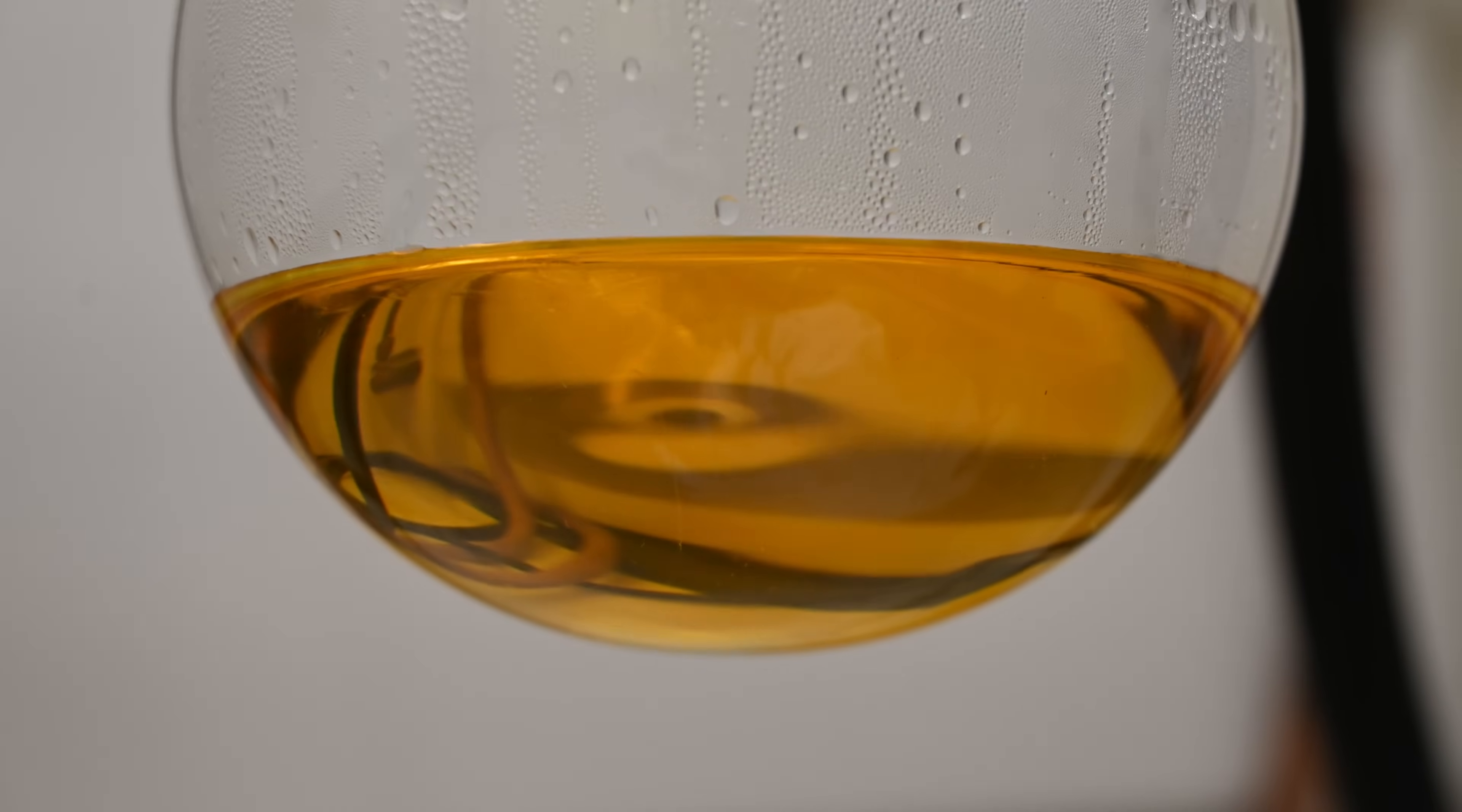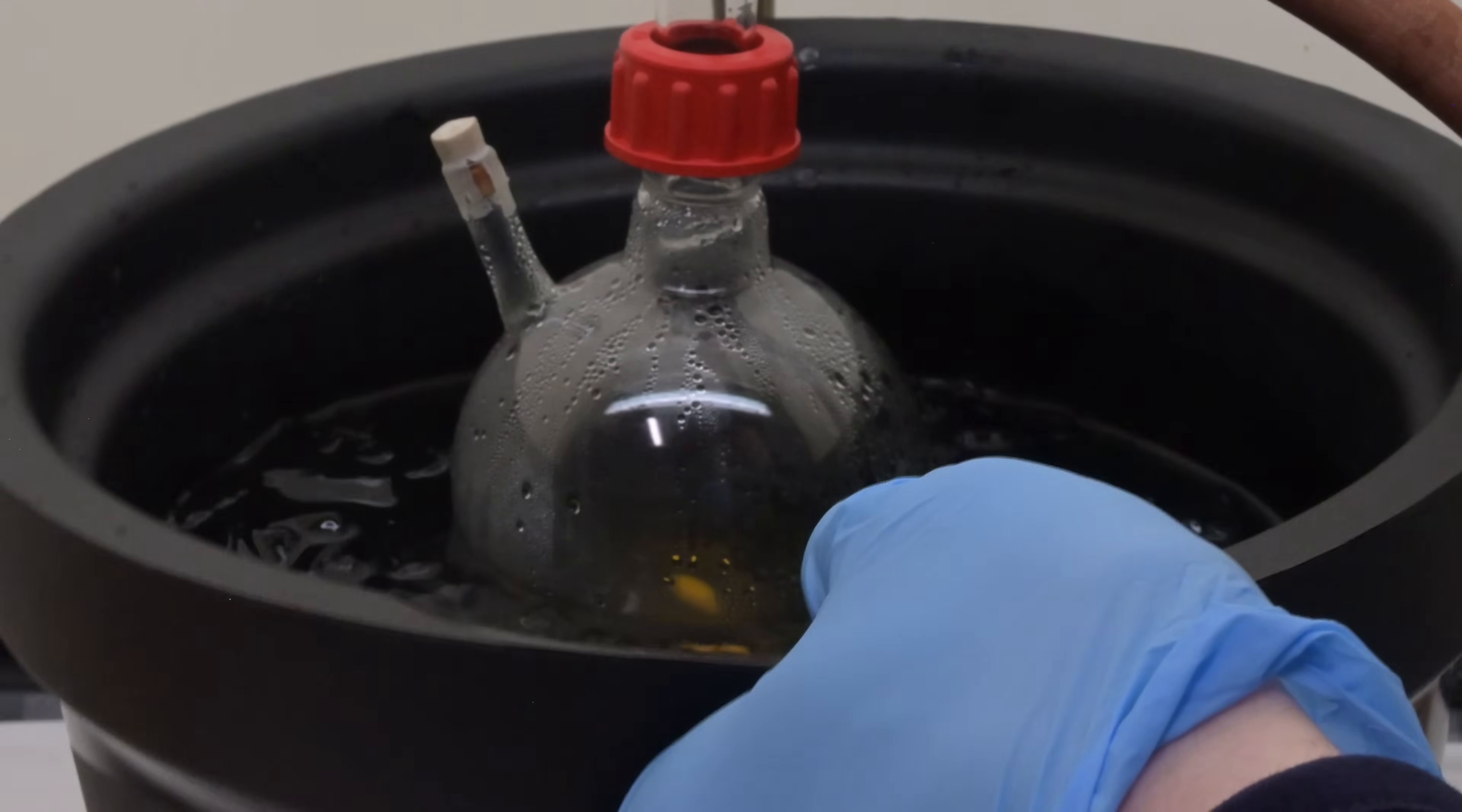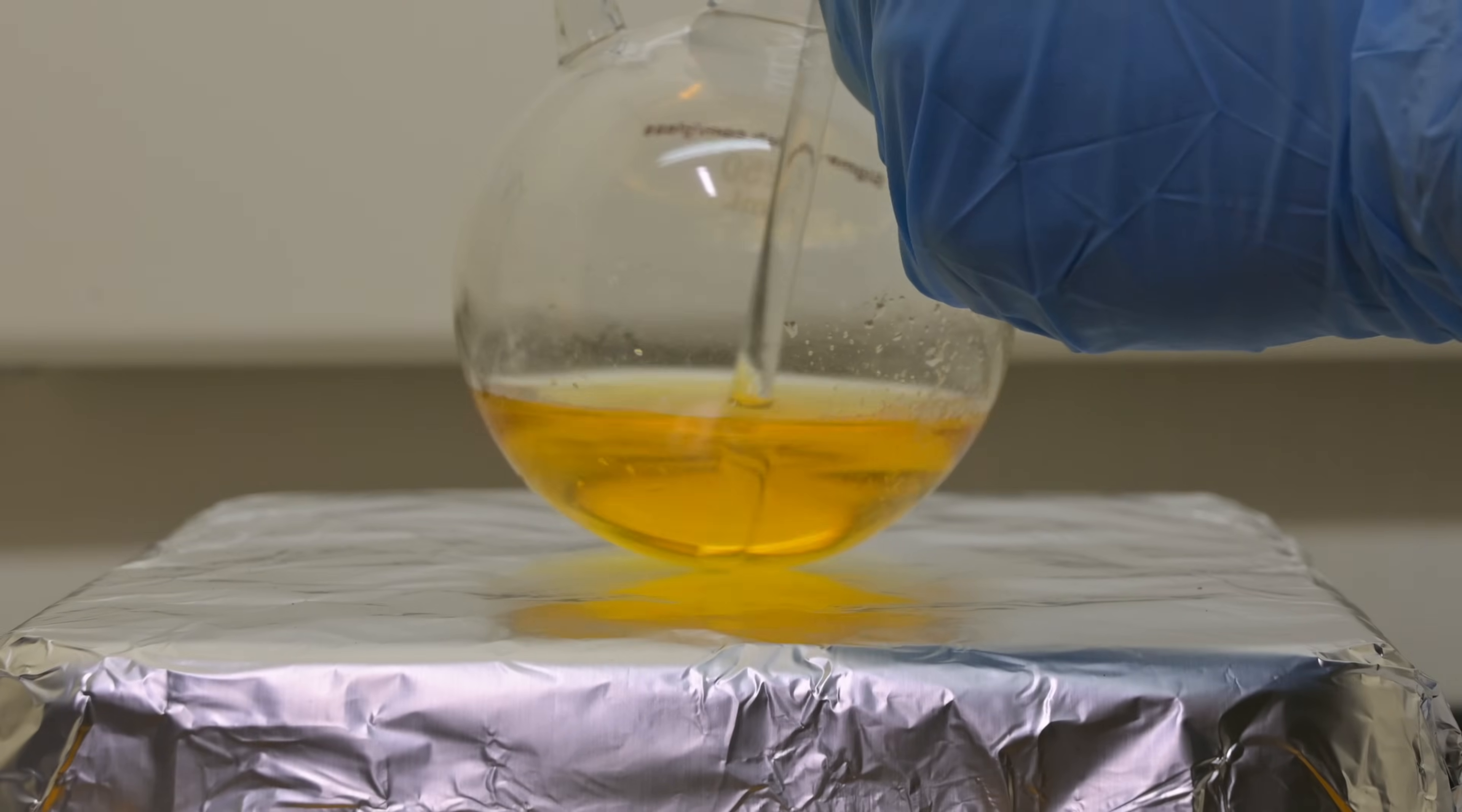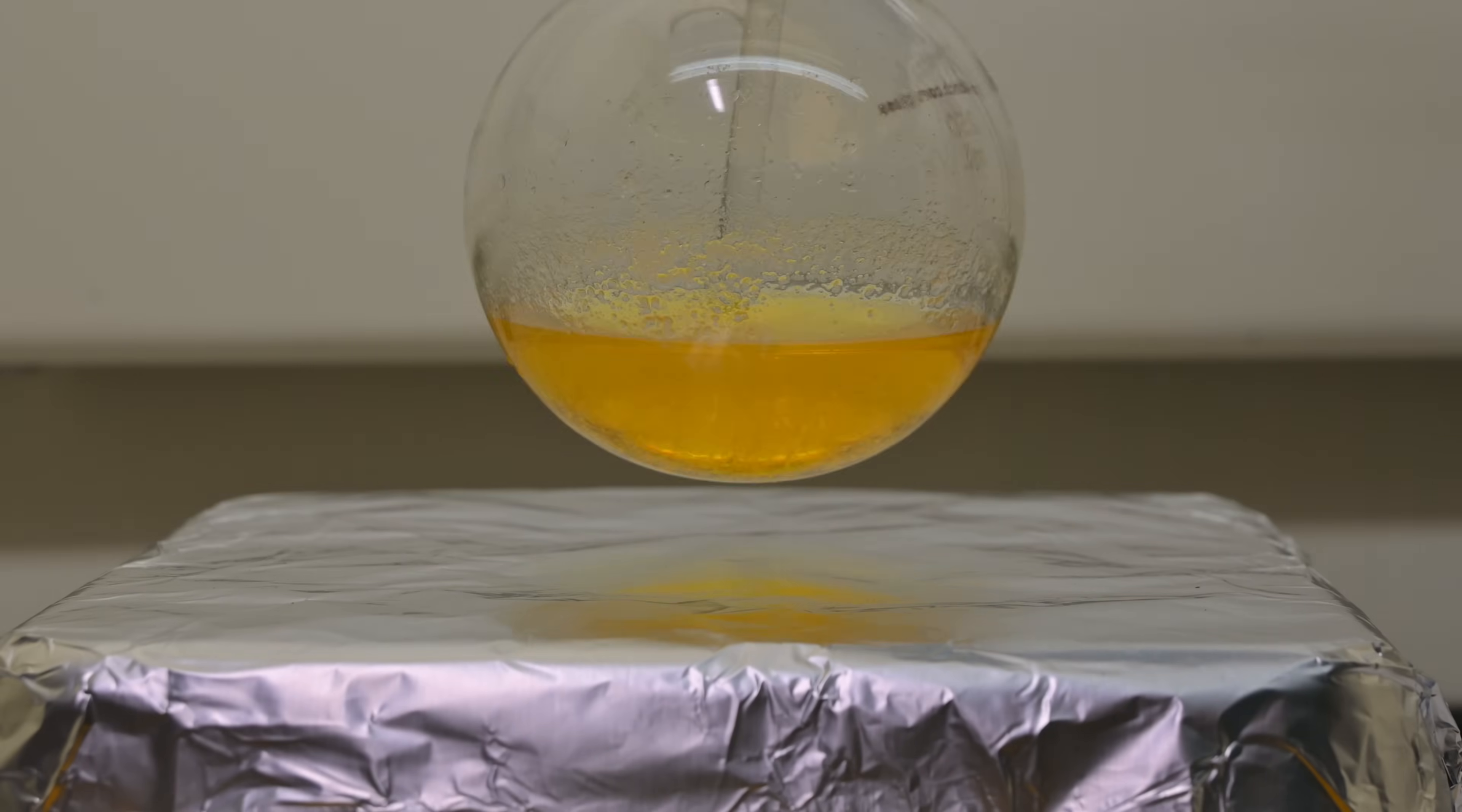After 90 minutes, we remove the flask from the hot water bath, allowing the mixture to cool. To further encourage crystallization, we place the flask into an ice water bath. I tried swirling, but no crystals. So a trick is to scrape the bottom of the flask with a stirring rod to promote crystallization. It does this by creating nucleation sites, places where crystallization can start.